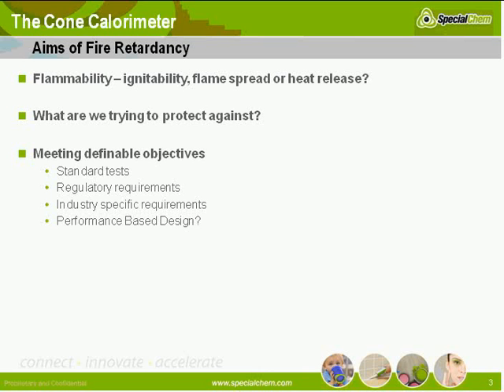the objectives of a particular test. For example, by adding materials, you can make something drip, which removes it from the test zone. In some cases, this is very good fire science, and it removes the material from the heat source, which of course will stop a fire. In other cases, you could have drips which transfer the heat or transfer the material closer to the heat source, which cause worse problems. So it is also scenario dependent.